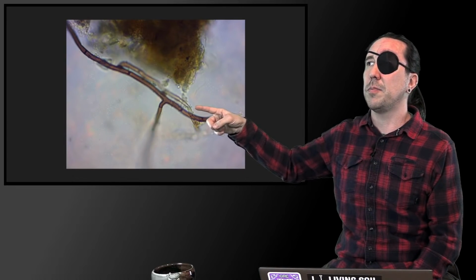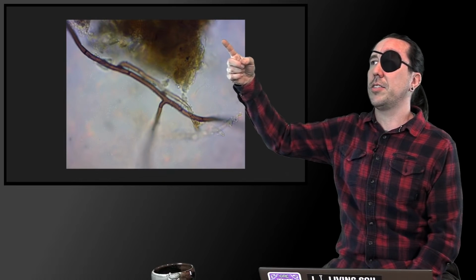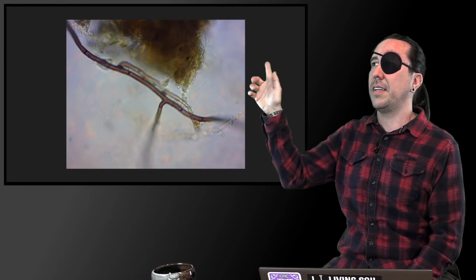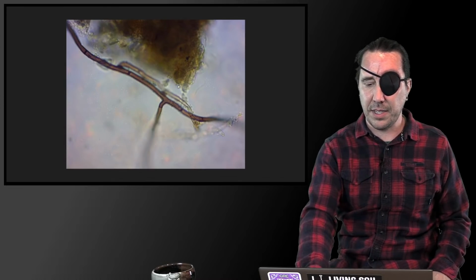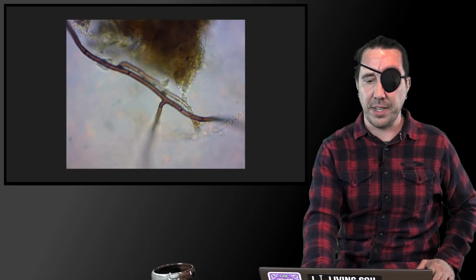And then as far as bacteria, it's hard to see some bacteria in this. You've got some specks right here that are easy to see, but also here, so this is yellow color. We've got fulvic acid inside the aggregate here, and there's bacteria that is just all surrounding there. So all those tiny little dots, there's so many that it just kind of fades into the picture, but those are bacteria.